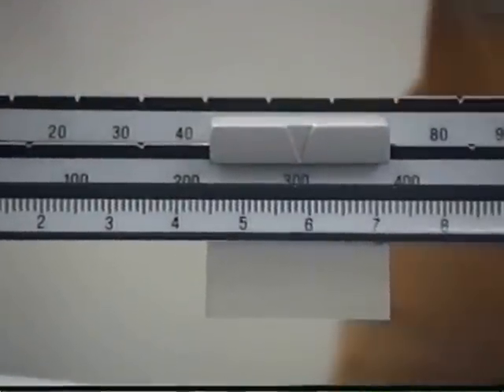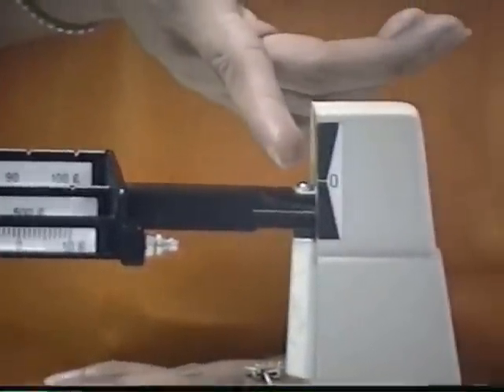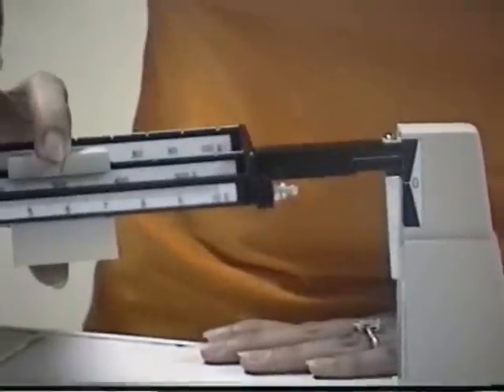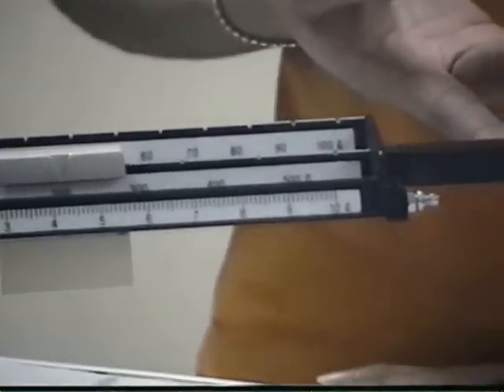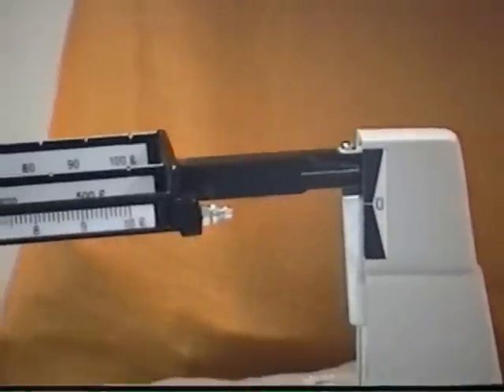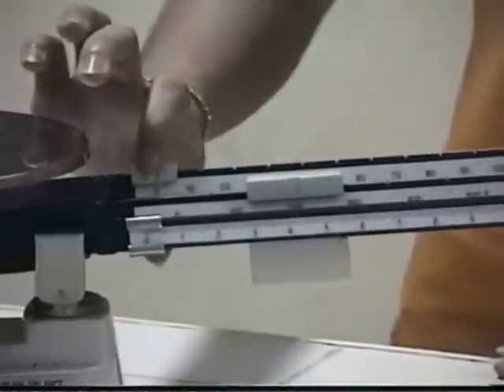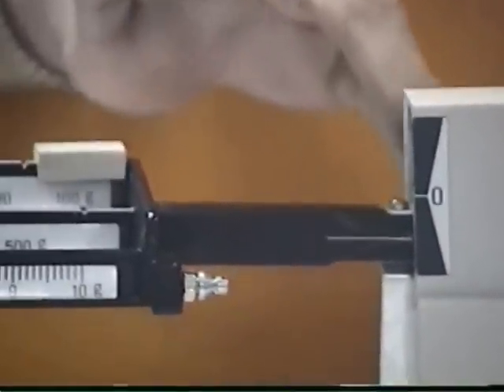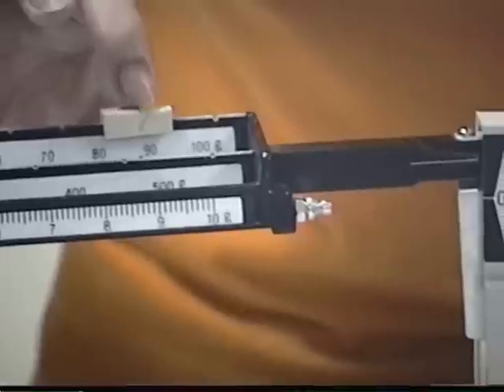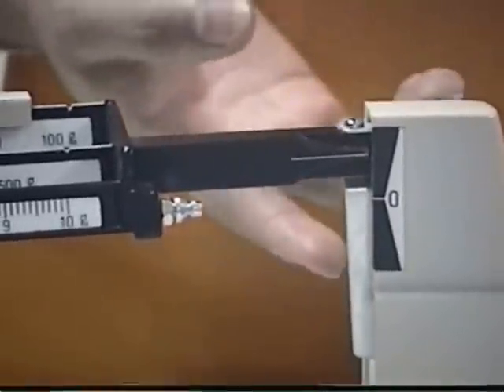Let's try 300. As you can see, the pointer is already down, so it means it is heavier. So let's move it to adjust. Let's try 200 — as you can see, the scale has moved. So we use another rider. Let's try 100 — it doesn't fit the scale. Let's try 90 — as you can see, it doesn't move again.